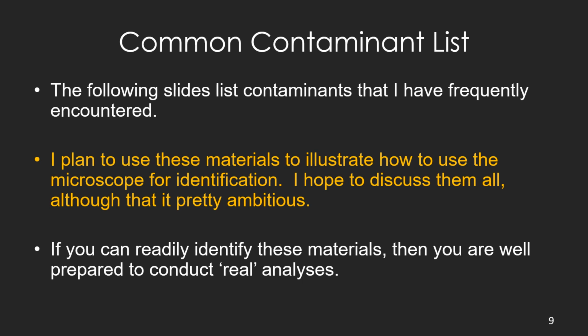Now, the following slides, again, something I hope I can get into either my website soon or that I can attach in some fashion to the comments or the description of this video. The common contaminants that I have encountered, I've listed in the following slides, and I'm going to use these materials to illustrate how to use the microscope, and I really would like to go through all of them, although that might be a bit of a challenge.